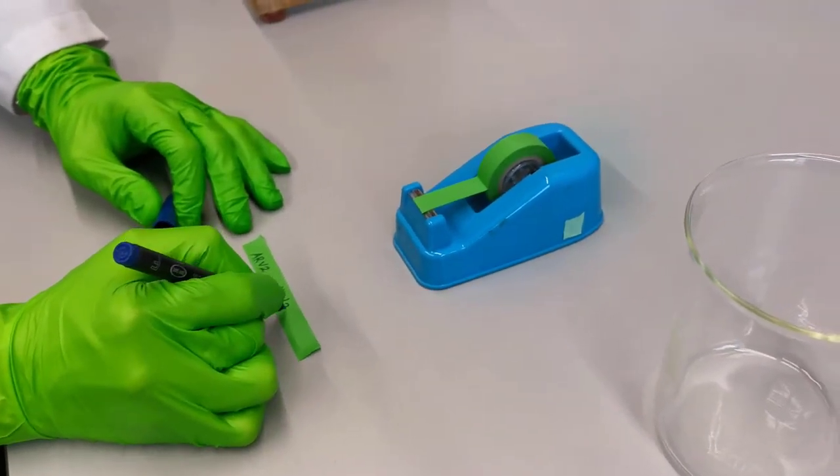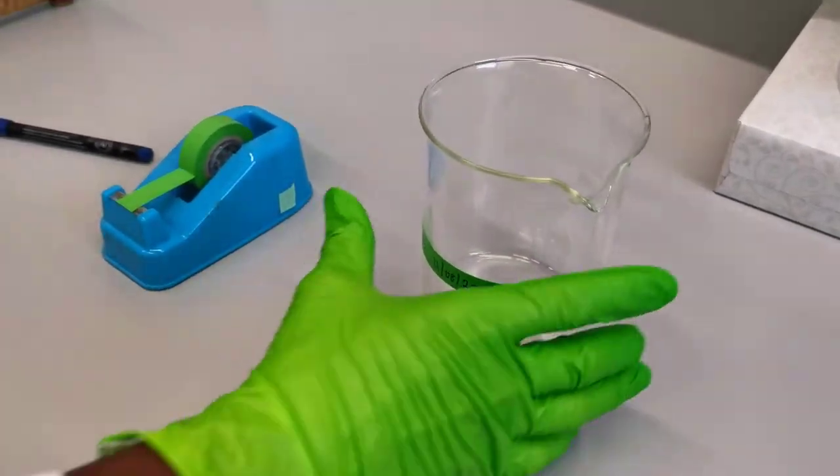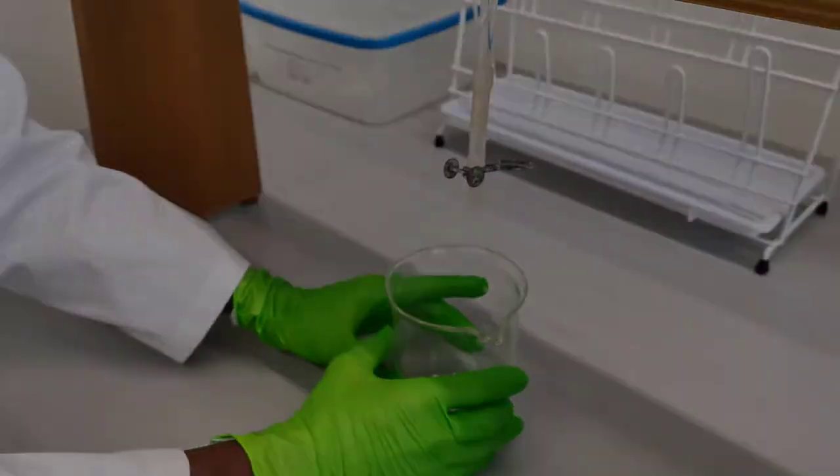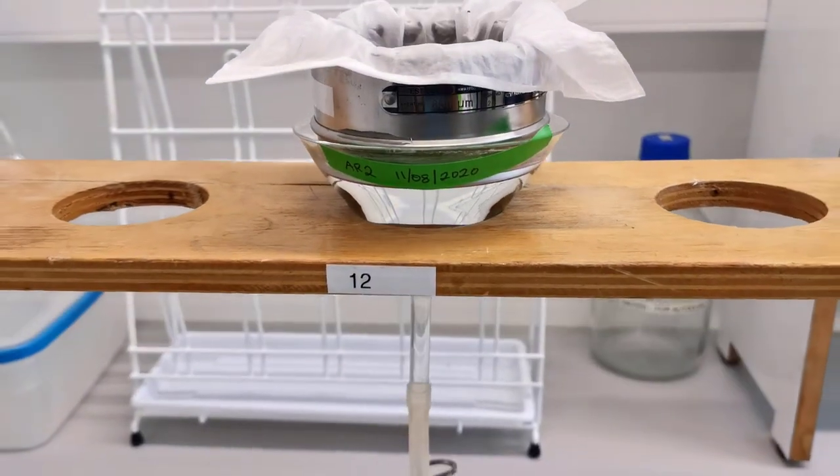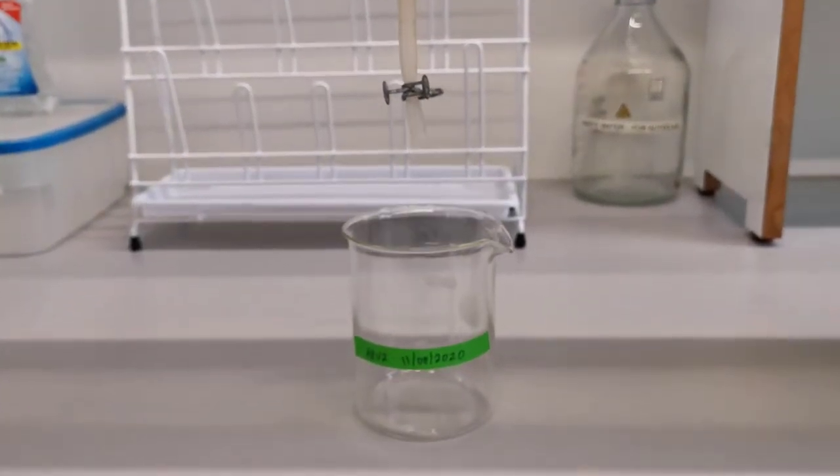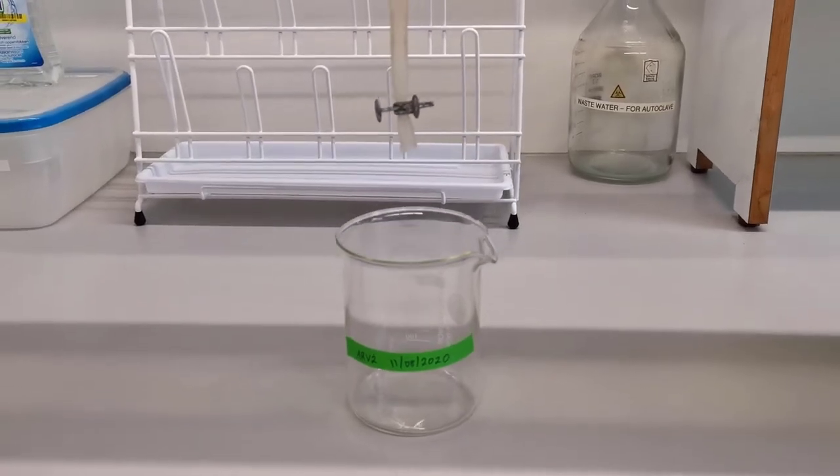You will also prepare a collecting beaker well labeled as in the case of the funnel. This is the final extraction setup which will be left at room temperature for at least 24 hours, during which motile nematodes from the sample will move into the water and collect at the bottom of the tube.